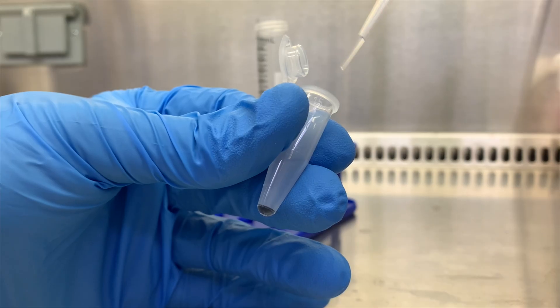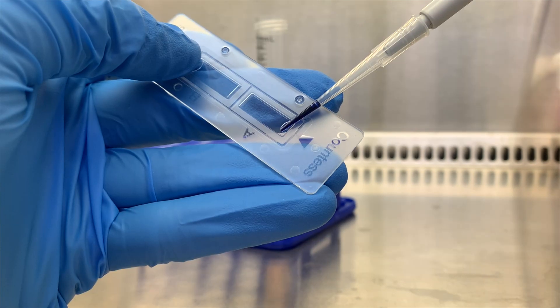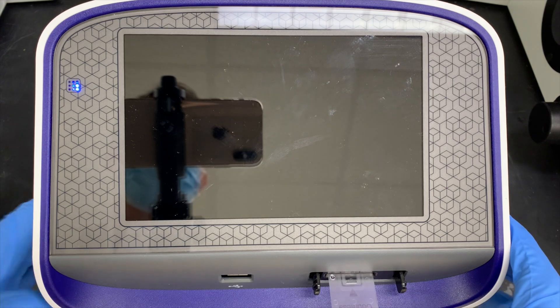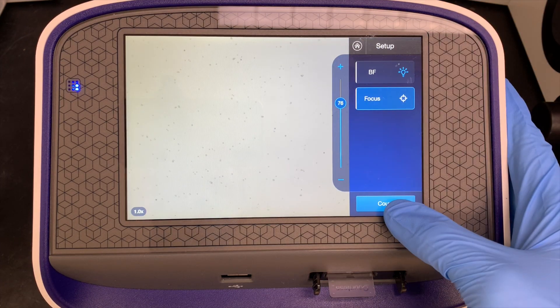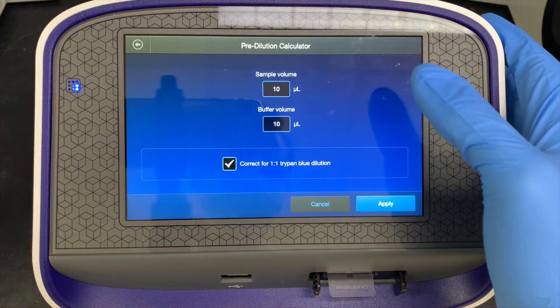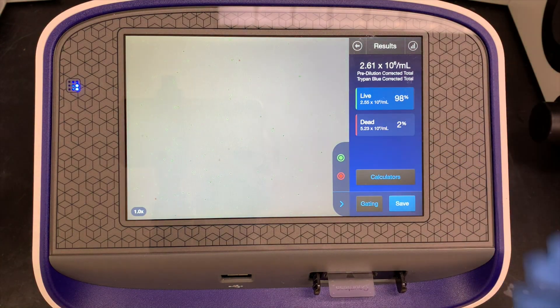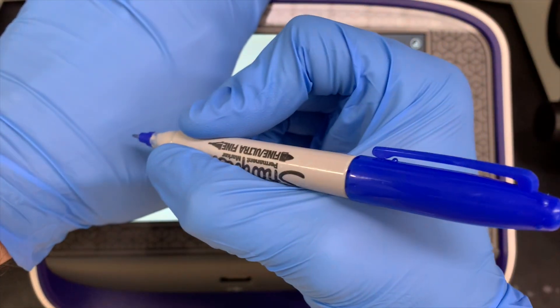Now for counting, I'll resuspend them in 5 ml of media — start with 1 ml just to get them resuspended well, and then add the other 4 and mix. Let's grab 10 microliters of that 5 ml and mix it into our pre-prepared Eppendorf with trypan blue, before we put 10 microliters of that mix into the cell counter slide. We'll just make sure the calculations are right — yep, 10 to 10 trypan blue. I use the viable cell count and usually round it down just a little, so I'll note 2.5 million cells per ml.